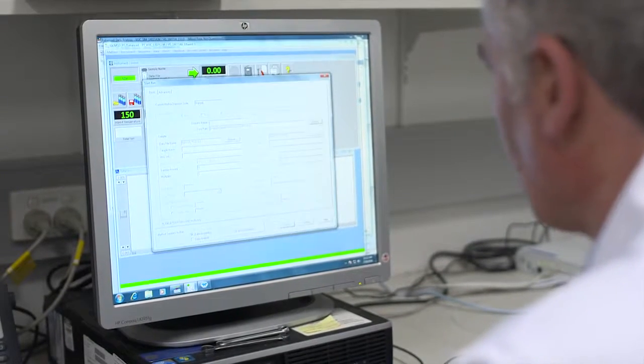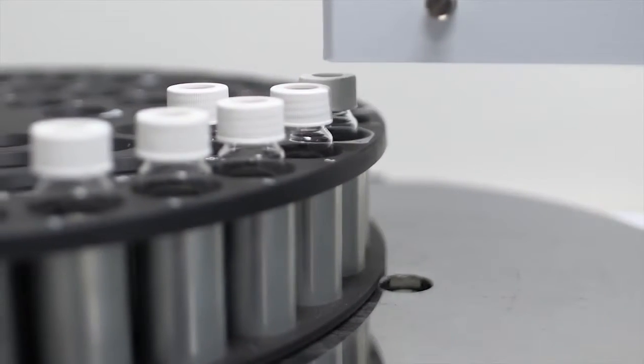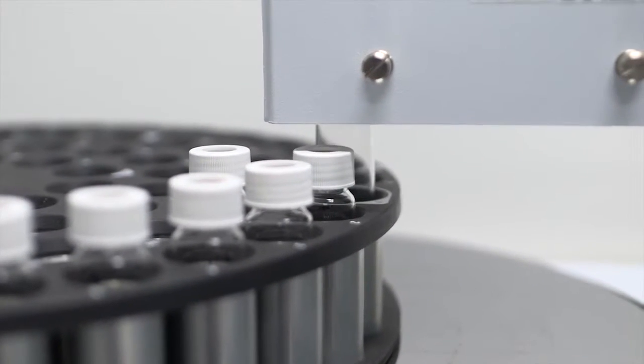The mass spectrometry information allows rapid identification of unknown chemicals. The analysis requires minimum sample preparation and a sample can be tested and results obtained within 40 minutes.